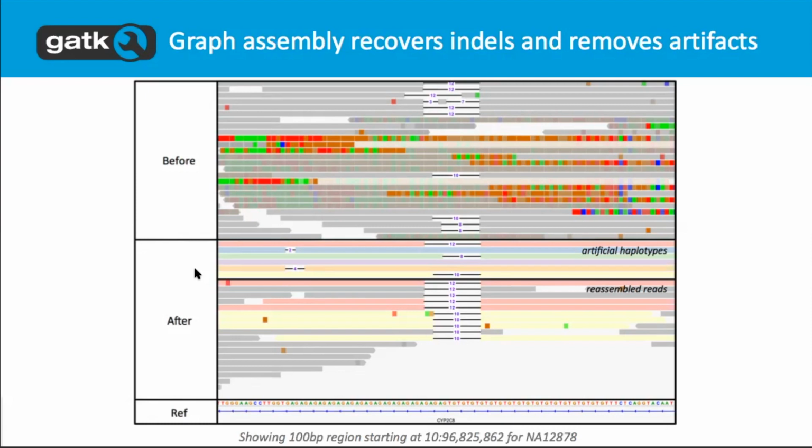It didn't use a graph assembly. It did a much simpler multiple sequence alignment. This is a lot more powerful because the graph has much fewer constraints in terms of what it can come up with. That makes sense. Any other questions?